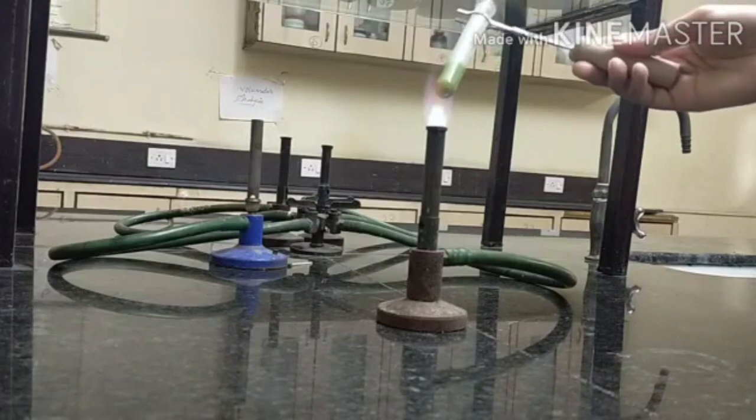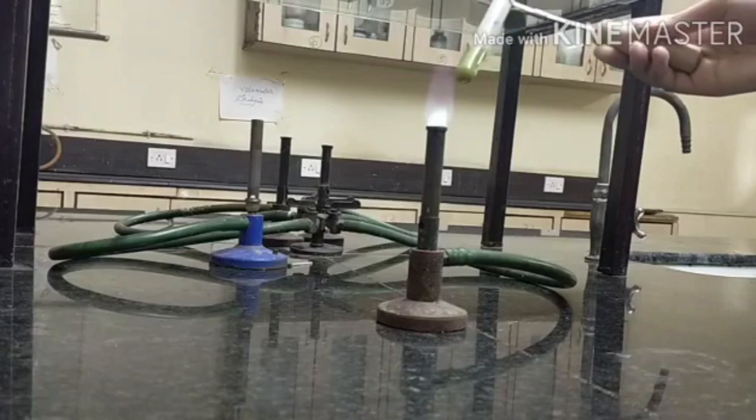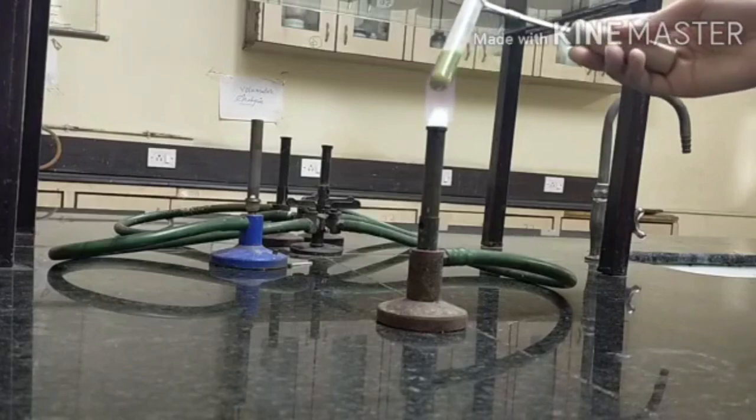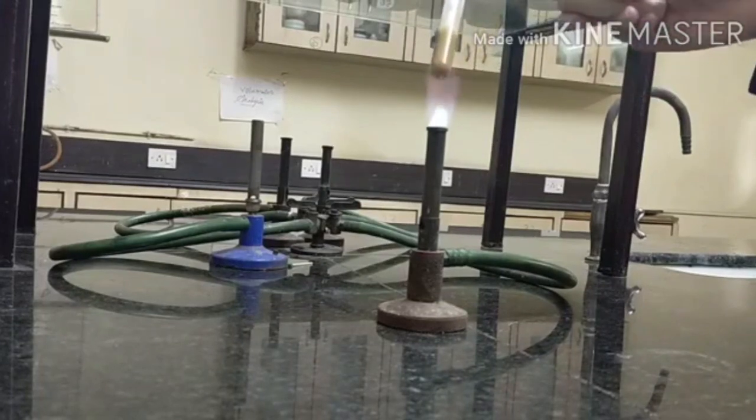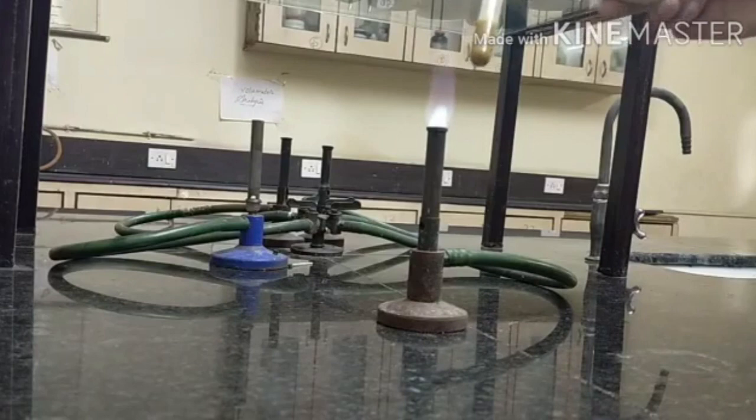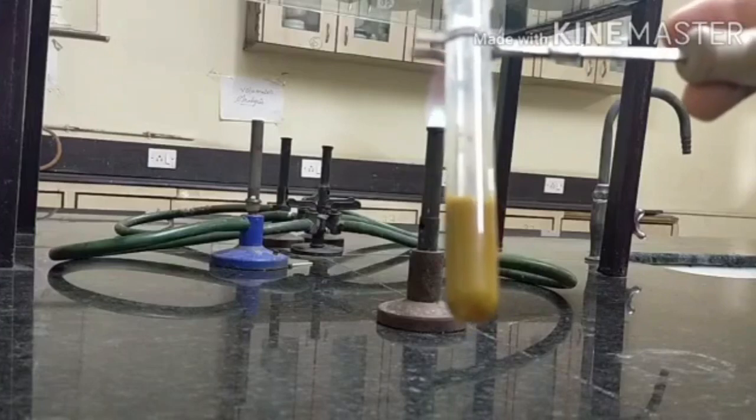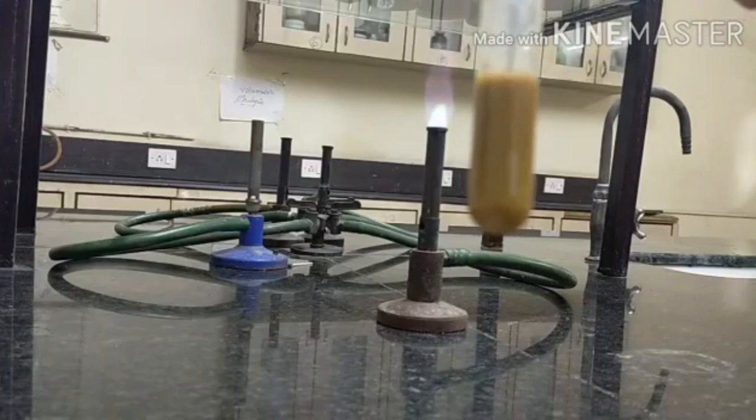We will see the changes, meaning the blue color changes its color. If it changes its color, it indicates that the unknown sample contains carbohydrate. See, the color is reddish brown. It indicates that the unknown sample contains carbohydrate.